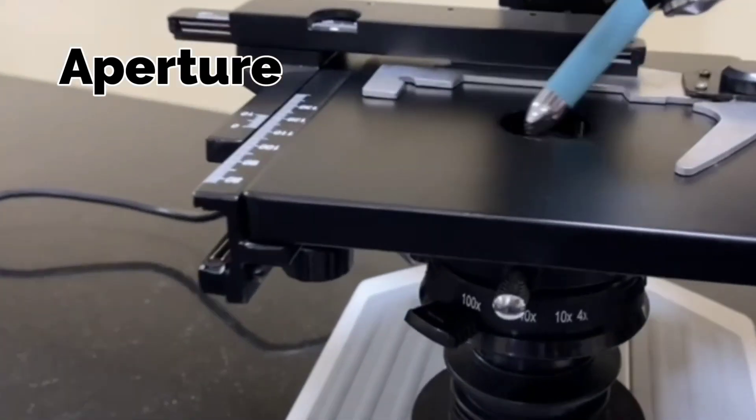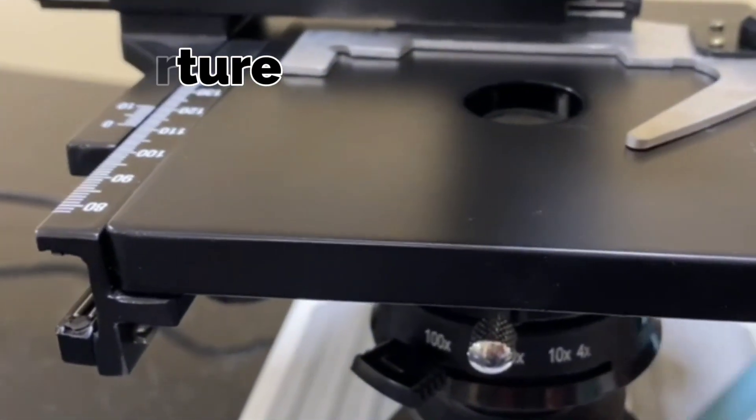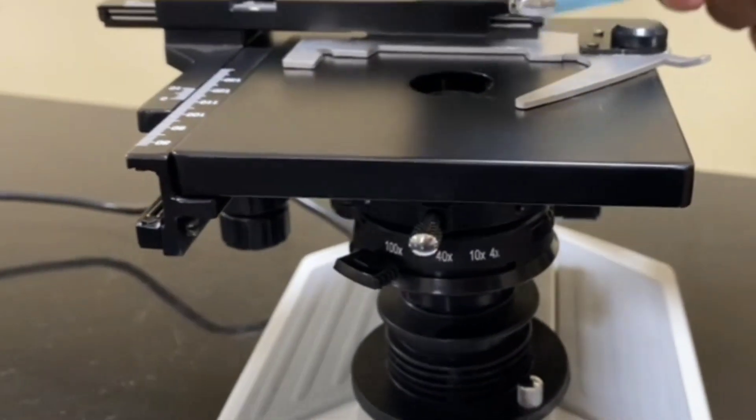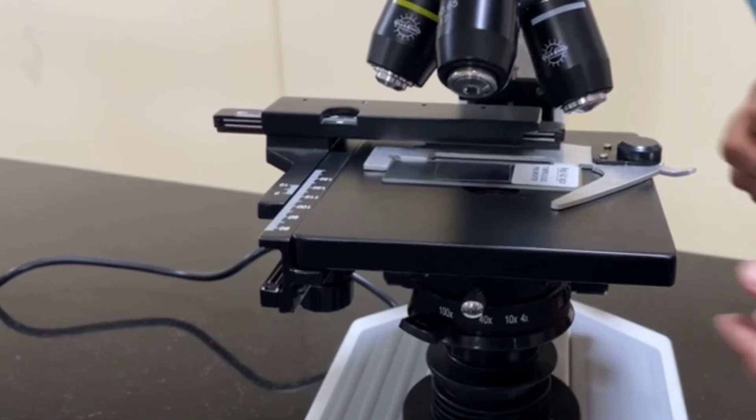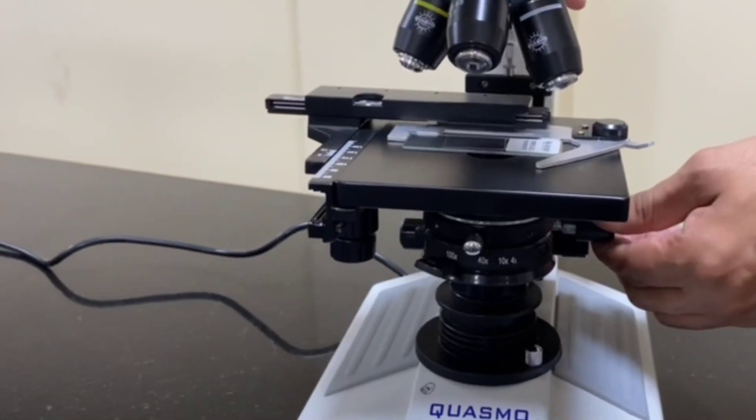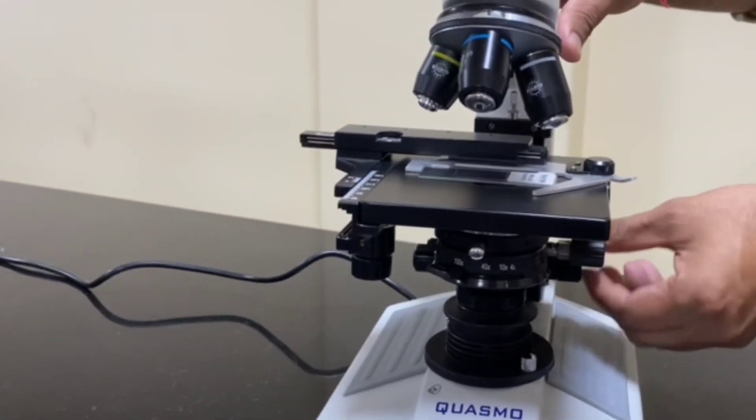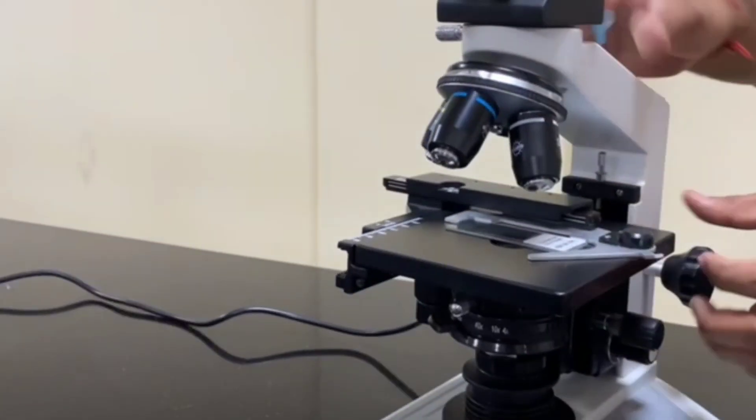This is the aperture of the microscope and light comes here from the downward portion. You can fix the slide here and you can visualize this slide by the help of objective lenses and eyepiece.